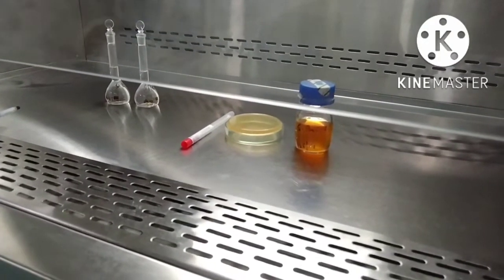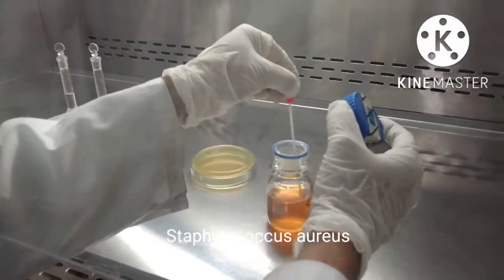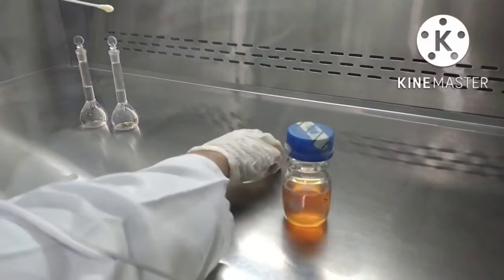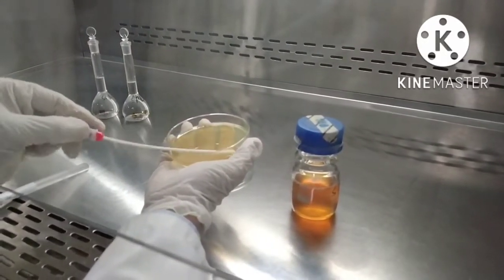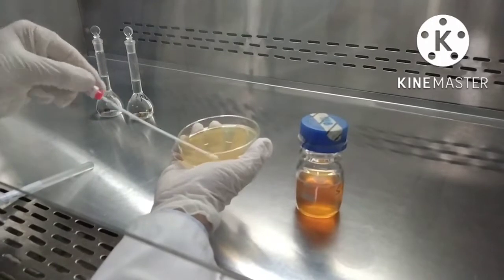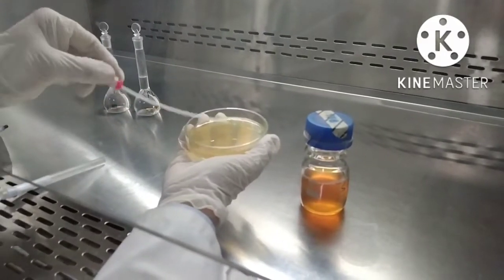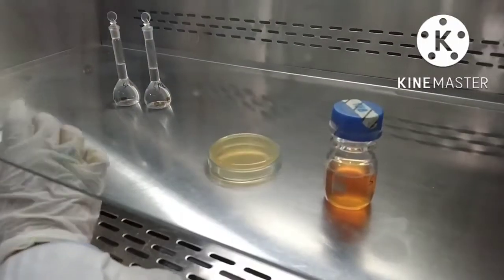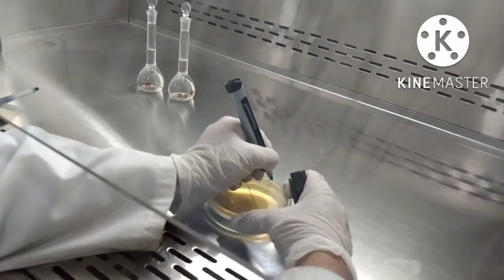Now we will start streaking media plates with pre-incubated strain of Staphylococcus aureus. Now divide the media plates into two parts by a line.